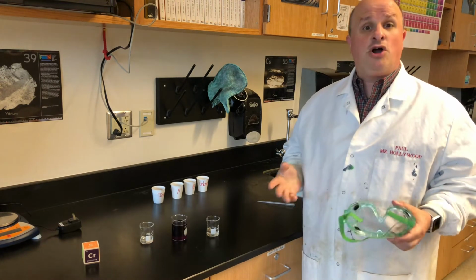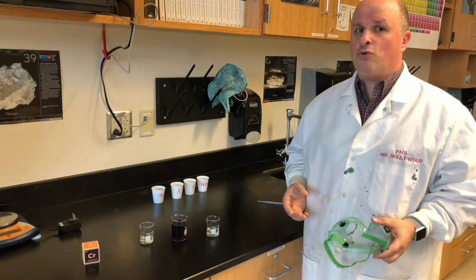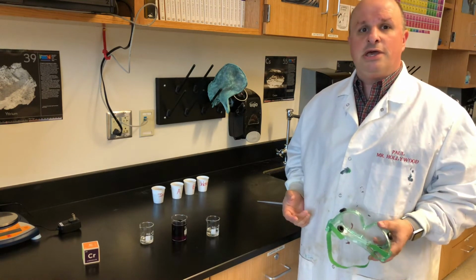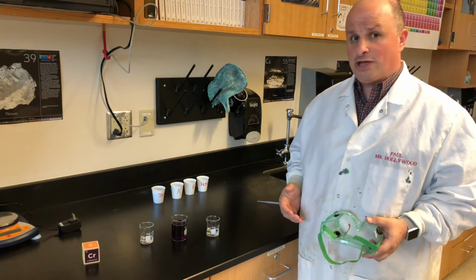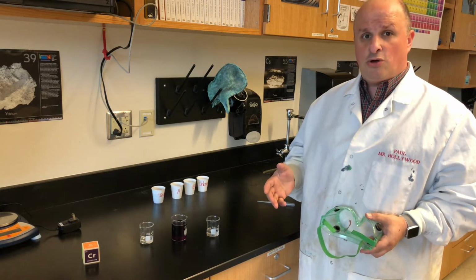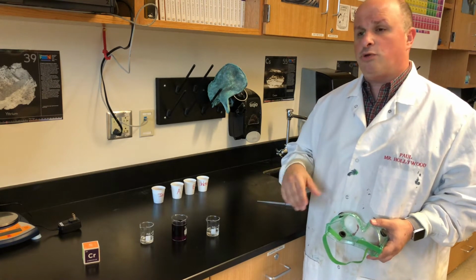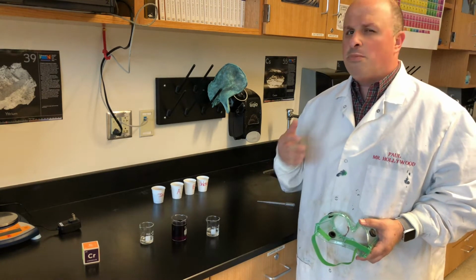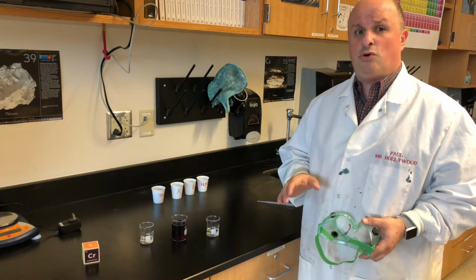This lab is called the color change lab because we're looking at the third sign of a chemical reaction, which is a color change. Normally when a color change happens, it's a sign that there has been a chemical reaction. Some exceptions, though, are when you add a coloring to something, but it stays the same, like when you put food coloring in the food, but it still tastes the same. That's a sign that that color change was not a chemical reaction.